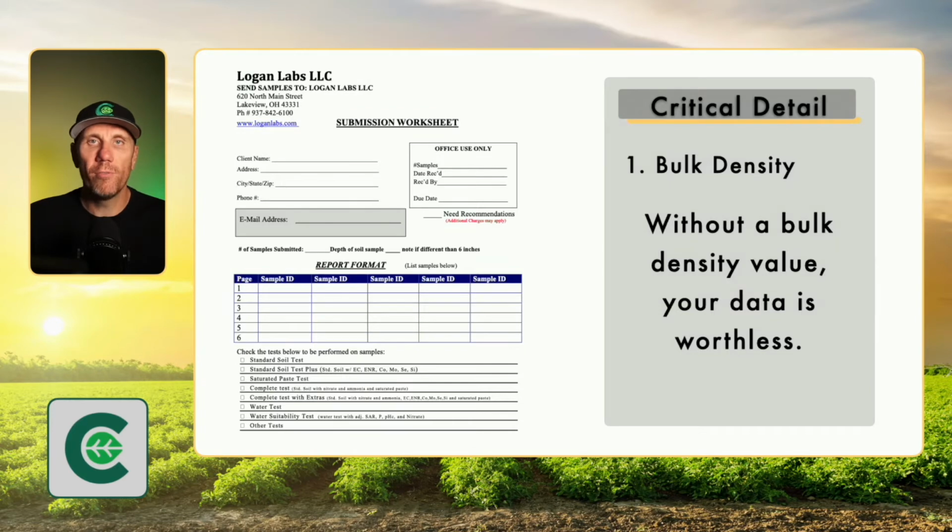It's very common for potting soils or nursery mixes to have a bulk density as low as 0.1. Even the heaviest potting soils are somewhere around a 0.6. Most native soils are 1.5 or greater. This means that if you have a lightweight potting soil and the lab assumes that you have a 2 million pound per acre slice soil, your data is at least 10 times skewed, and your amendment applications are going to be 10 times over as well. I think this is one of the biggest problems with anybody trying to make actionable advice or sense of the soil testing procedure.